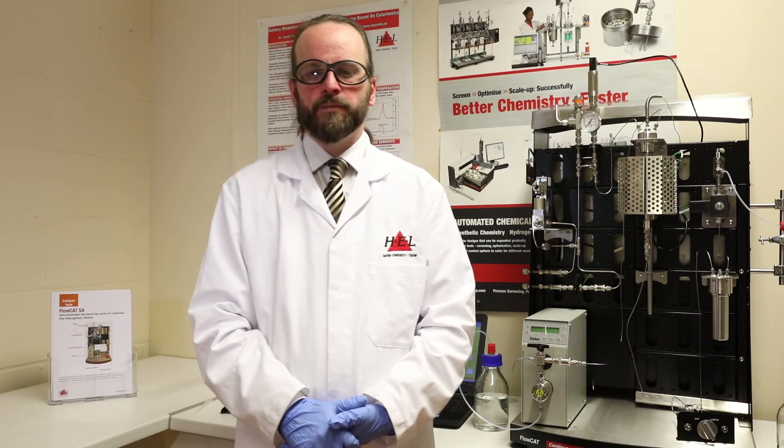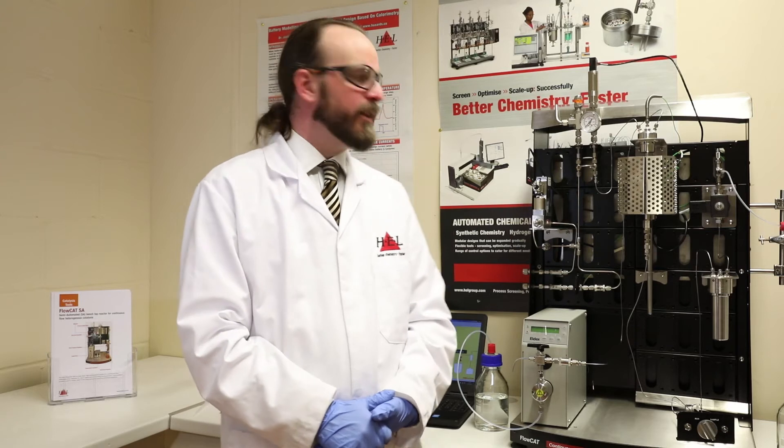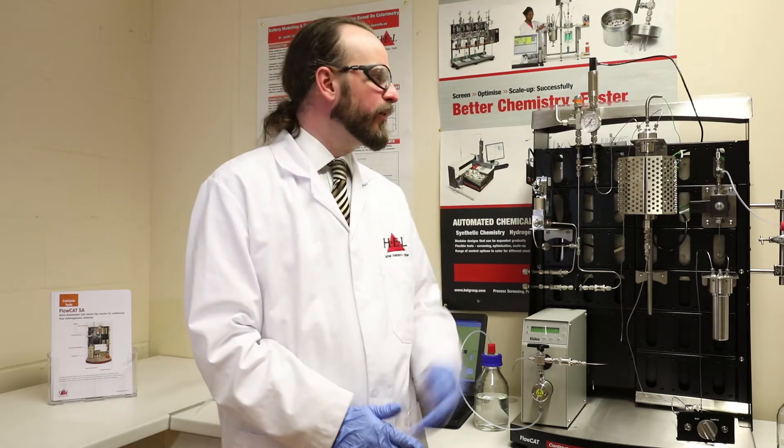So let's turn to look at the system now. Flowcat is principally used for liquid and gas reactions such as hydrogenation, carbonylation or direct oxidation. It runs at relatively high temperatures and pressures. This system here is rated to 200 bar and 400 degrees C, although our standard system is 100 bar and 300 degrees C. For most organic chemists, these temperatures may seem high. What you've got to remember, in flow, you're into a hot zone and then out of it very quickly. So potentially you can drive chemistry at far higher temperatures you'd ever be comfortable doing in batch.